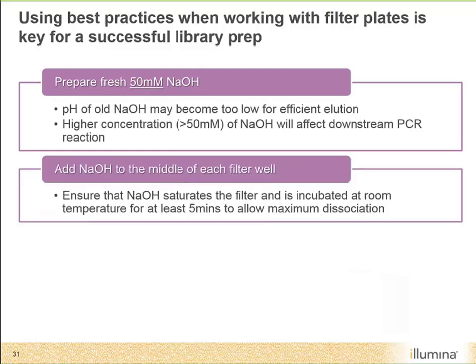When we're adding the sodium hydroxide to the filter plate, again, I know it can be really tricky being so shiny, we want to make sure that we're adding the sodium hydroxide to the middle of each of the filter wells. This ensures that the sodium hydroxide saturates the filter and that we are incubating at room temperature for at least 5 minutes to allow for maximum dissociation.